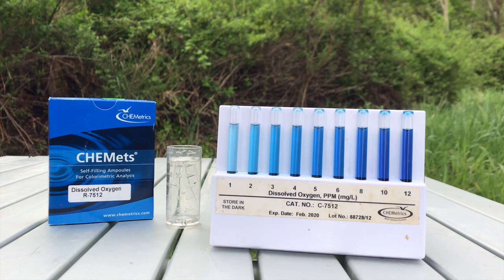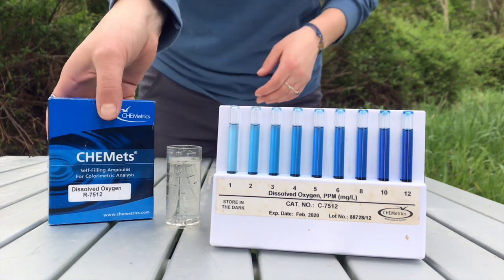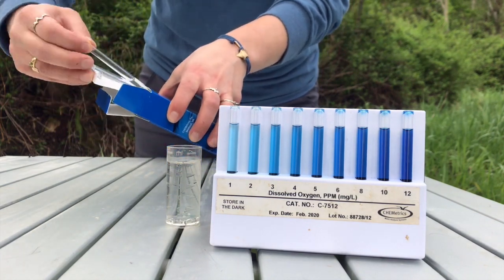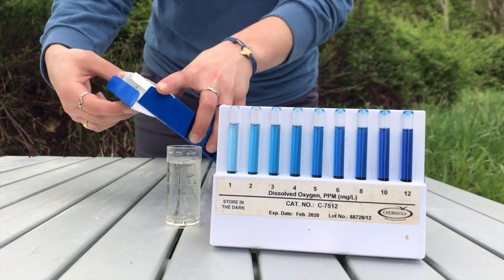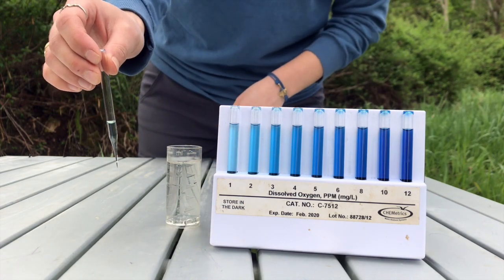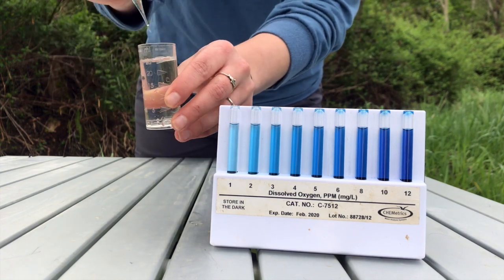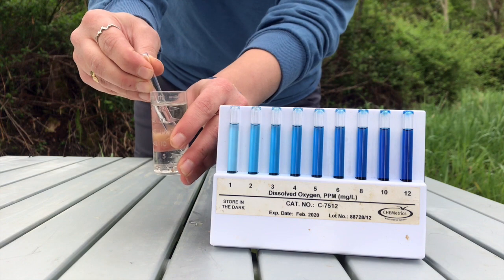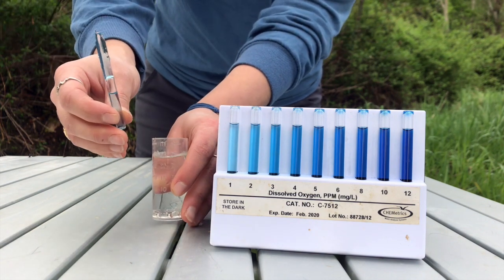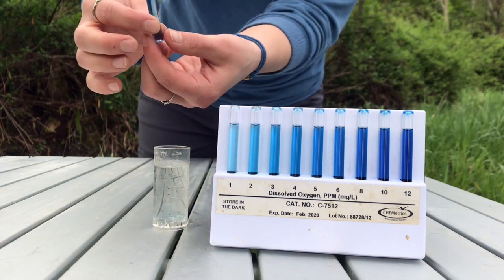Alright, we're ready to conduct our first water quality test for dissolved oxygen. The test kit we're using today is called the indigo carmine method. Basically, we have these ampules filled with a chemical solution designed to react with oxygen present in the water. To conduct the test, we snap off the tip of the ampule, causing it to fill with water from the sample we just collected from Jones Creek. The solution inside will change color depending on how much oxygen is present.